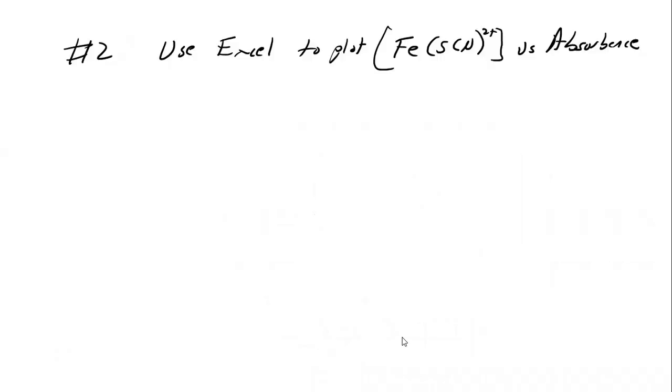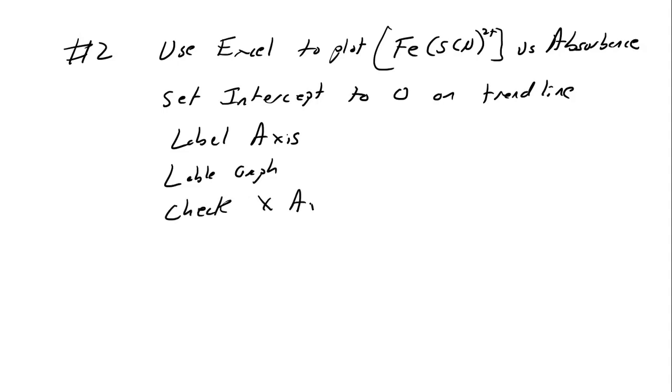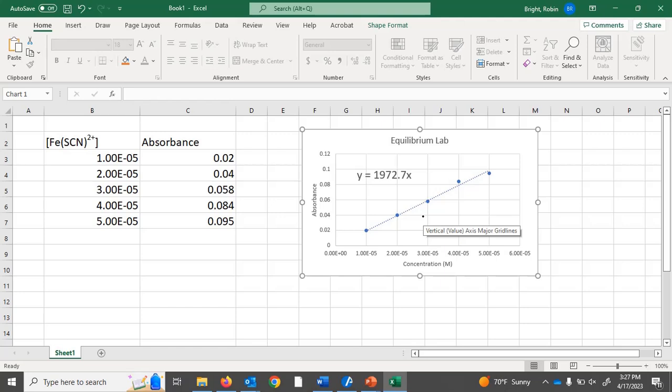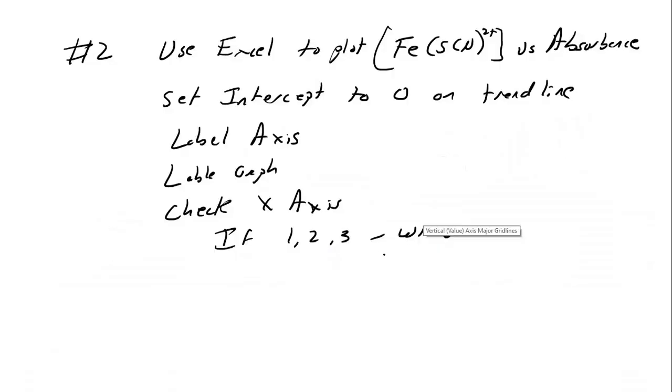So I got y is equal to 1972.7. And you need to print that out and put it into your notebook. So this is number two. So set intercept to zero on trend line. Label axis. Label graph. Check x axis. If one, two, three, it's wrong. So go back. And if you go back here, you'll see that each one of these says E to the minus 5th. If it doesn't say that, then you've put it in wrong. You've put some kind of text instead of just a number. So numbers only, no text like units.